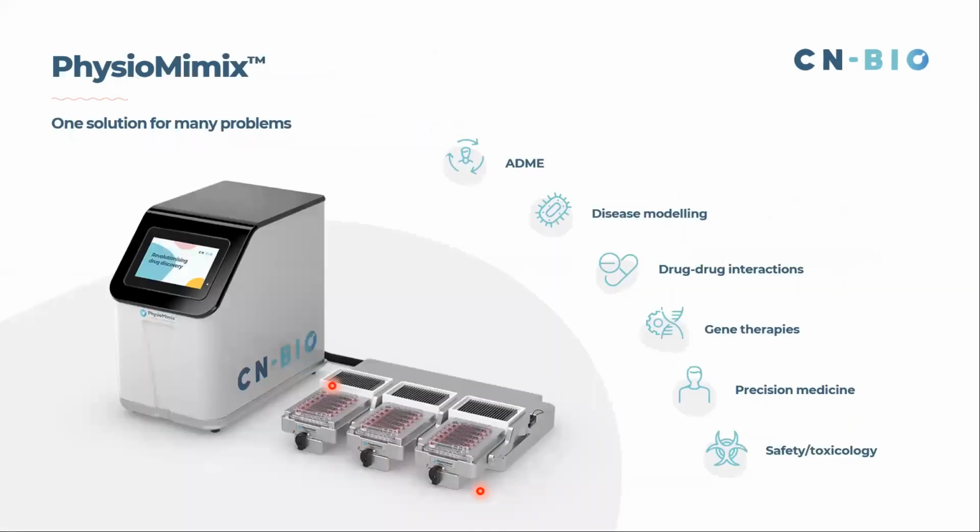So with this liver system, we can do a really wide variety of different activities, and we can utilize it for a variety of different problems. So we can use it for example, for disease modeling, looking at a variety of different compounds, whether they be small molecules or large molecules. What I'm going to tell you about today is how we use the system for both understanding drug metabolism and how we also use it to understand drug safety and toxicology.